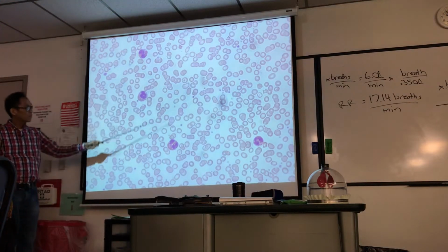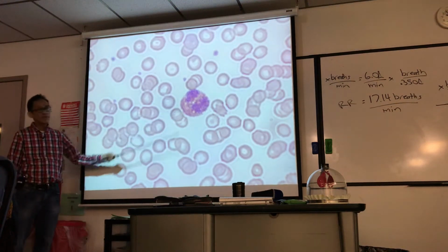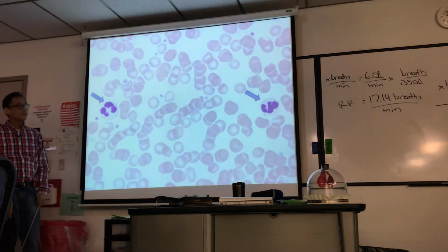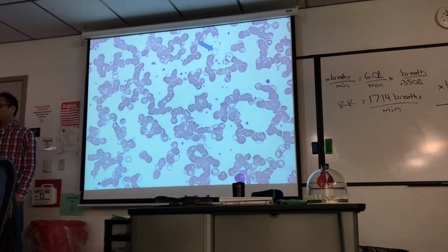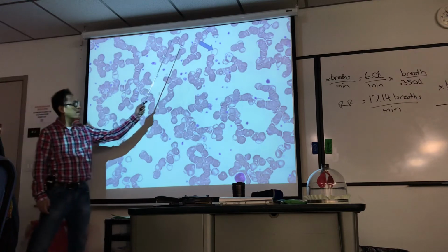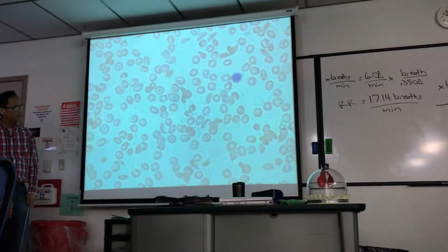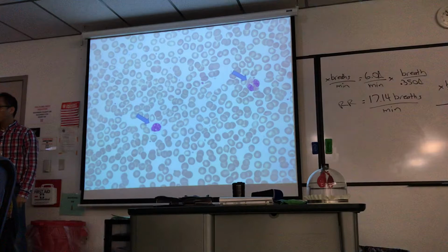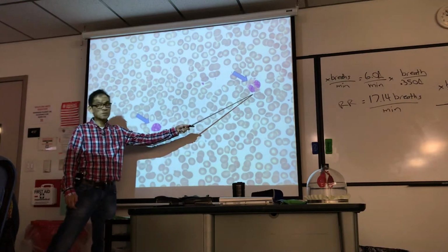These are all eosinophils. This is eosinophil. Both of these are the same cell. Neutrophil. If I said identify this blood condition, it's the iron deficient anemia. If I said identify that cell, microcyte. It's a little out of focus, but this is sickle cell anemia. These 2 cells are lymphocyte, eosinophil.